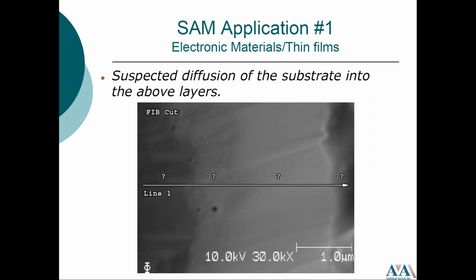So we have another question, but I would need a bit more detail before I can tell you the ideal technique. This question states, we have pores located in the cross-section of our material. Would this be a good technique to analyze the composition? They're about a half a micron in size. I would need to know what type of material this was, but something about a half a micron in size is probably SEM EDS, depending on what that material is. Or Auger, but again, I'd have to know a little bit more about the material.